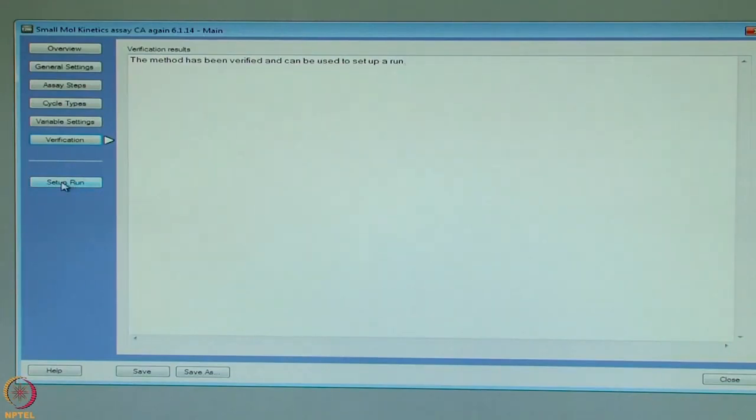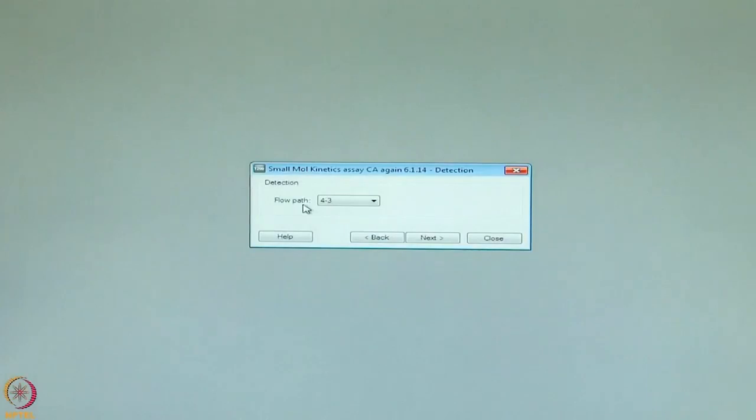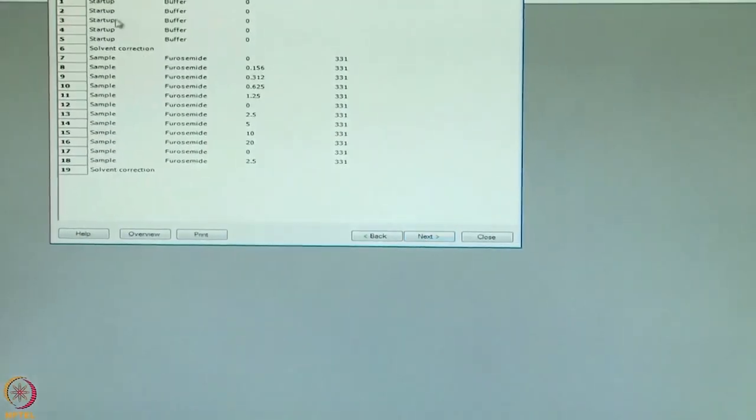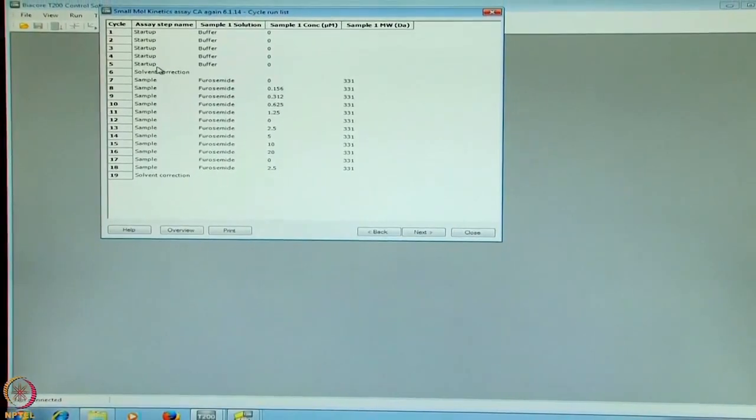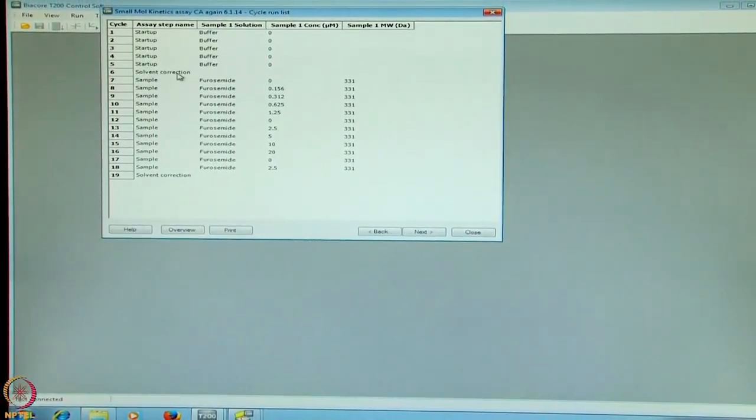We go into the setup. Here, the flow path is 4 minus 3. We go on next. We have 5 startup cycles. This means, one set of solvent correction before the run. And another solvent correction after the run. In between, we have the furosemide injected at various concentrations on the surface of the carbonic anhydrase. And the kinetic data is accumulated here.